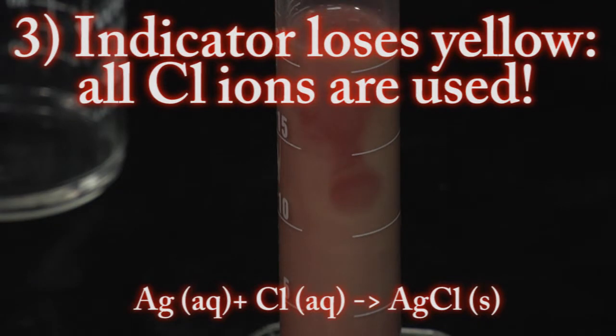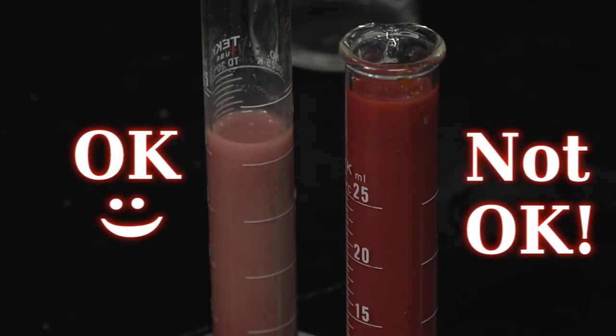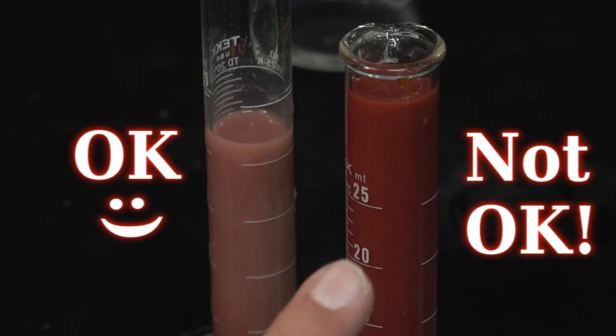Once this color stays, or is permanent, we can go ahead and stop our titration. Remember, we only want a permanent red-brown color. So as soon as we see that color stay, we know that our titration is finished.